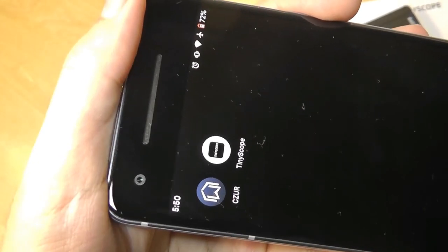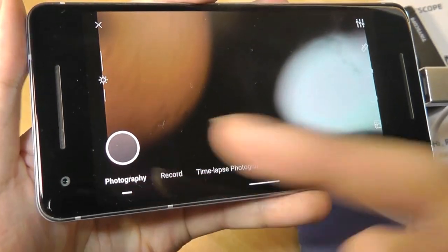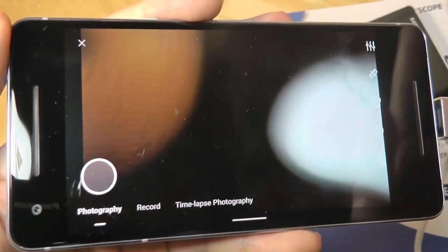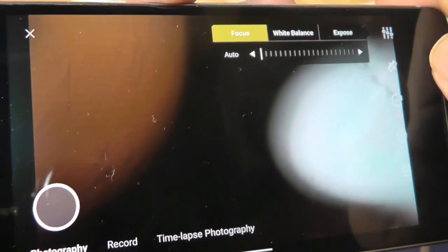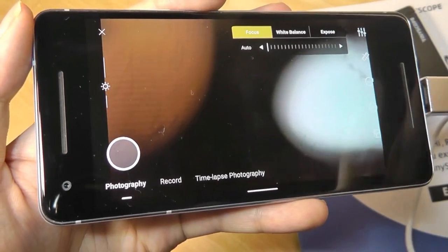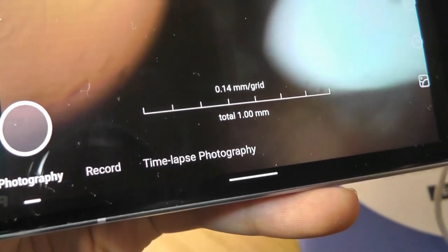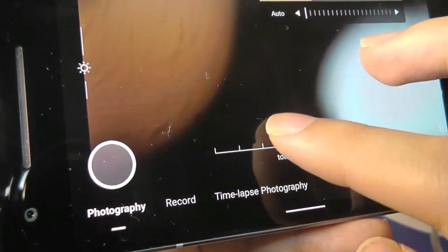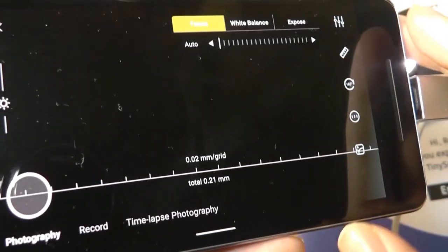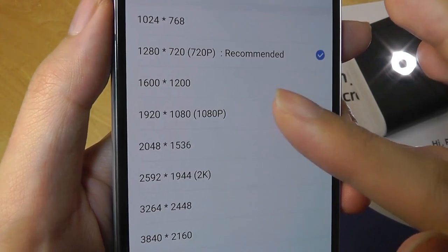The companion app from TinyScope will automatically launch whenever you plug in the camera, so it is pretty convenient. Afterwards you're able to take images just by tapping on the shutter key, also record video or time-lapse footage onto the phone's built-in memory. We're able to adjust certain properties such as white balance and exposure level. By the way, this microscope does have autofocus, so whenever you tap on an object it will try to sharpen the image depending on how far or close you are. We can take a look at how much magnification is currently working, and even zoom in and out a bit more using digital magnification. There's also a grid line that tells you how large the object actually is, as well as camera settings such as the resolution you're recording video at.